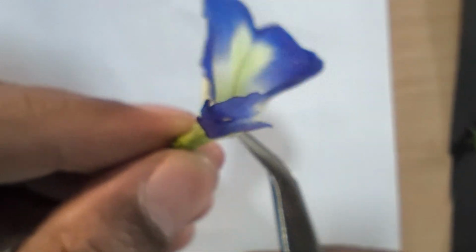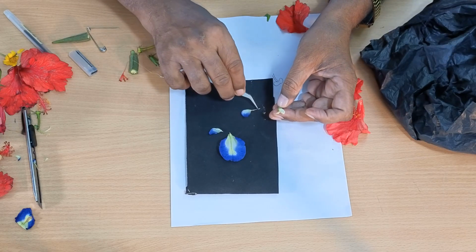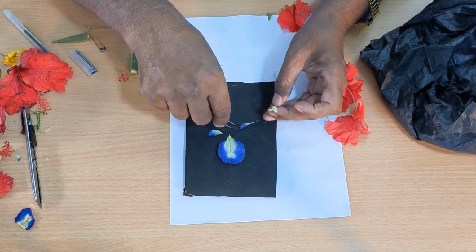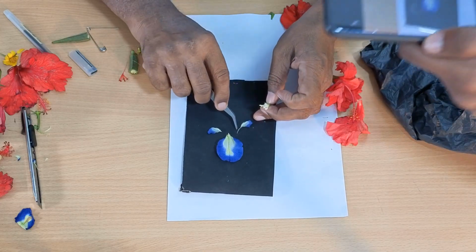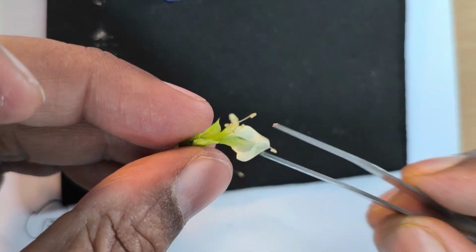So first let me take the standard petal, and then let me dismantle the wing petal, and we have to do this carefully because the wing petal encloses the keel petal, and this keel petal is boat shaped.